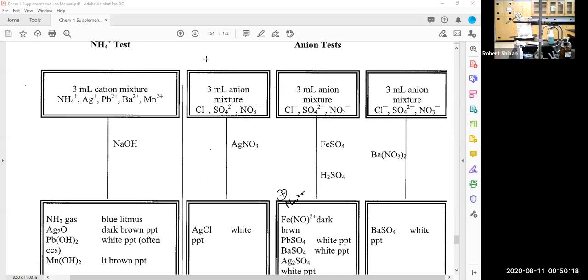So let me set up another piece of filter paper. Just fold this again into a quarter. I don't bother turning off the end. Wet it down.